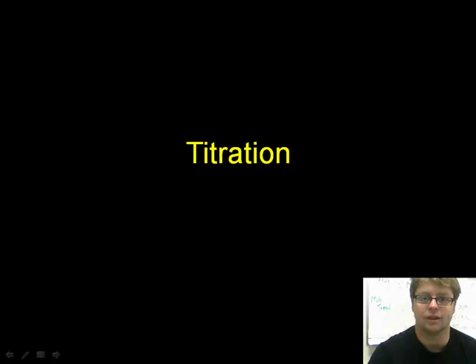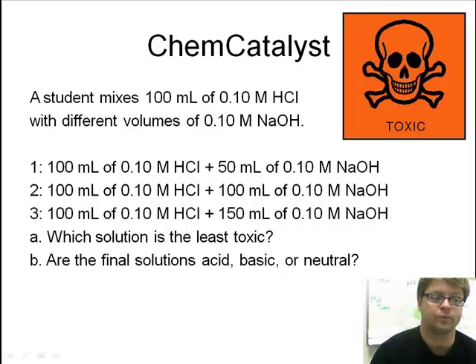Hey everybody, it's titration time. It's the time where we are going to find out the unknown solution using titration, which is a method of adding an acid to a base or a base to an acid and determining the concentration of an unknown acid or unknown base.